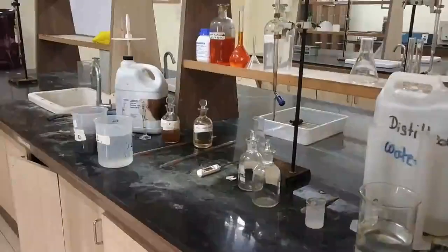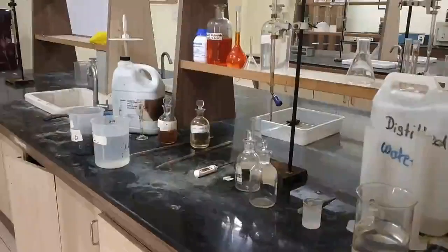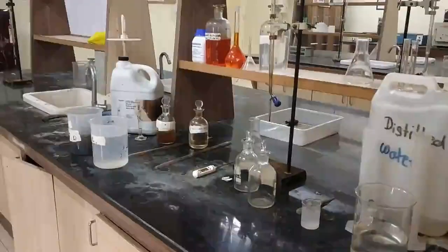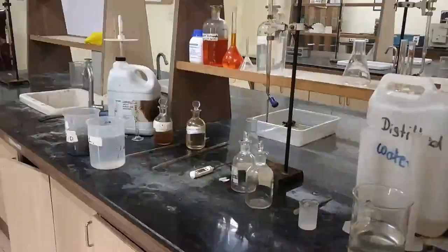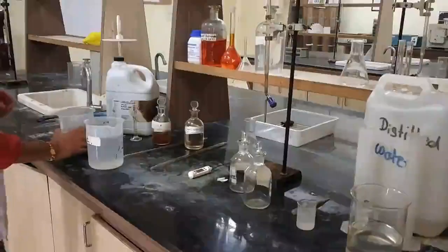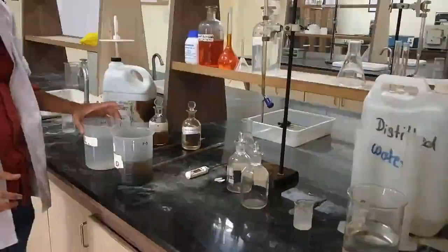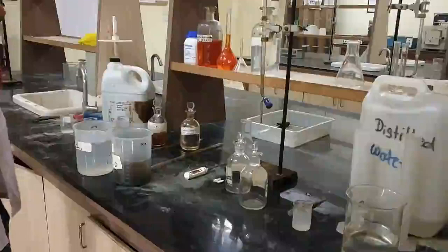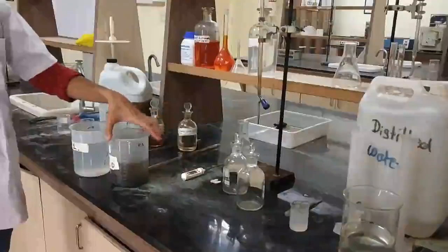We are going to see the DO determination experimentally. We have taken two samples. One is the sample that is collected from the tap water, and another is a sample which has a very high organic content, and you can see the color is blackish, right? So we have tap water and a very blackish water which has a very high organic content.